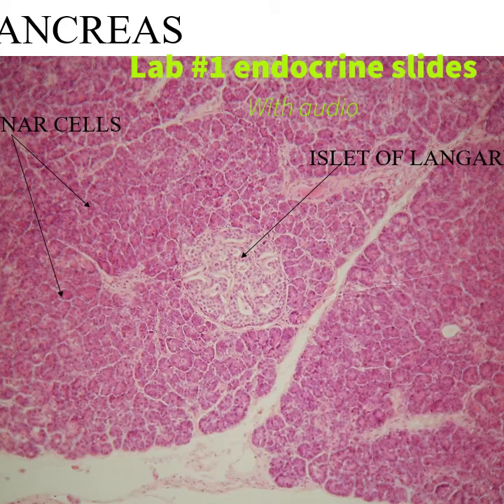This is the PowerPoint we looked at in lab, just going over the endocrine slides. I thought I'd go over it one more time and post it on Blackboard so you'd have it to refer to if you needed to. This is the pancreas. And the pancreas, as I mentioned, is a dual gland.